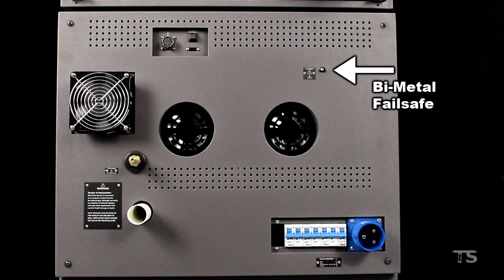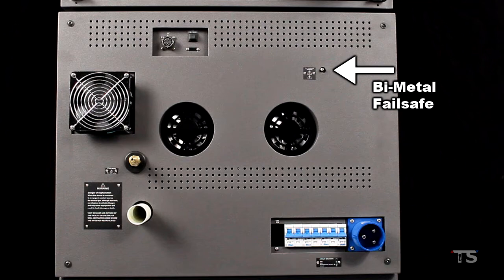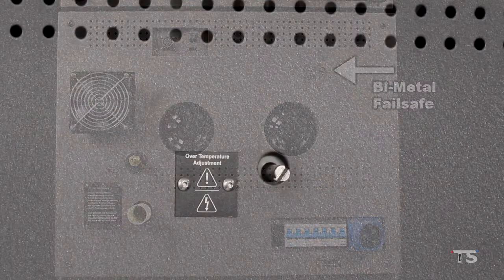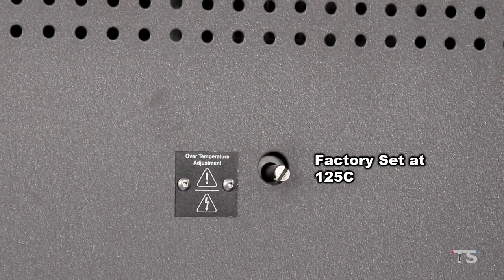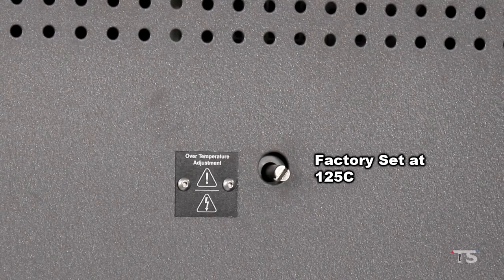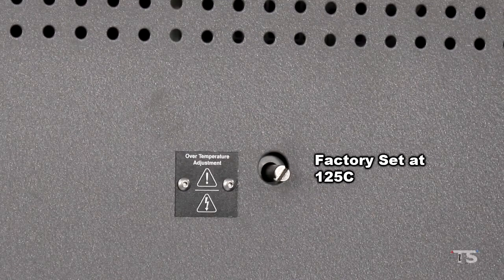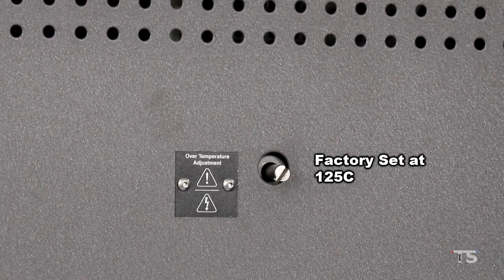Bimetal failsafes are intended to protect your thermal chamber from an over temperature condition. Bimetal failsafes are factory set at 125 degrees Celsius.